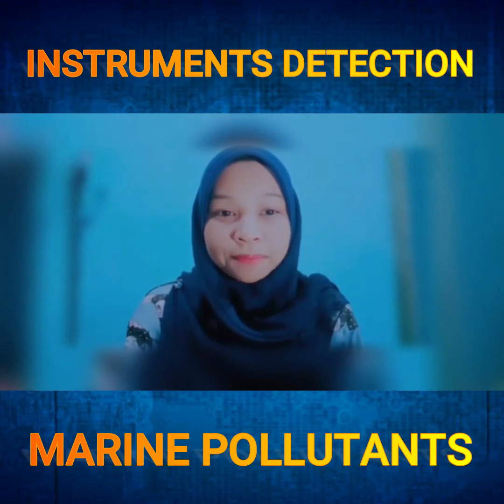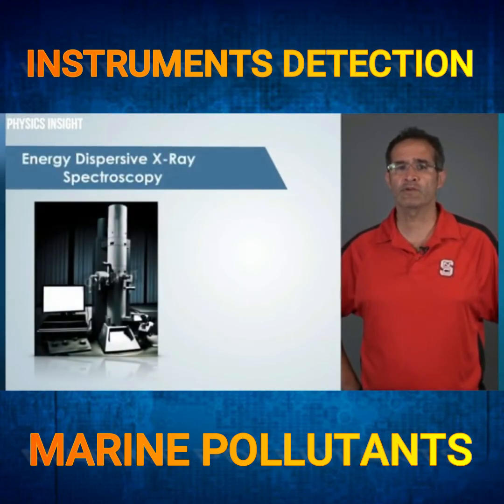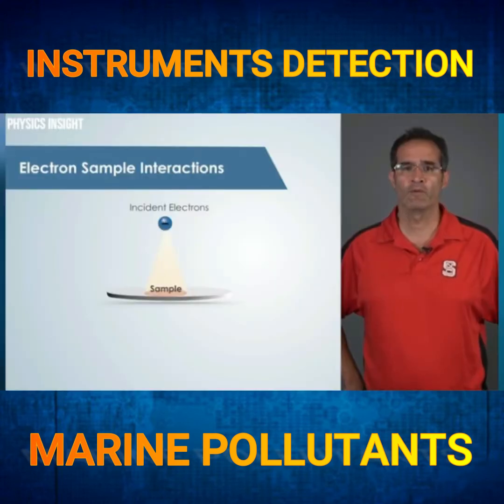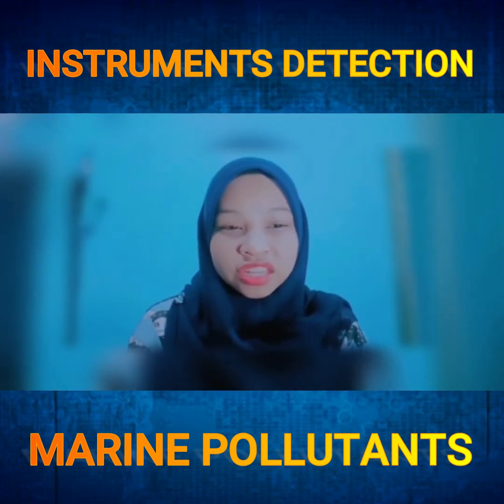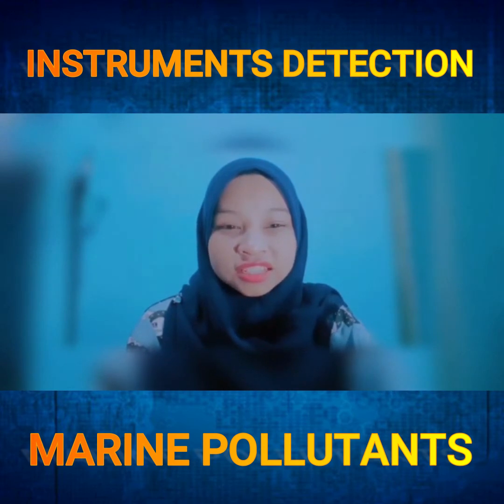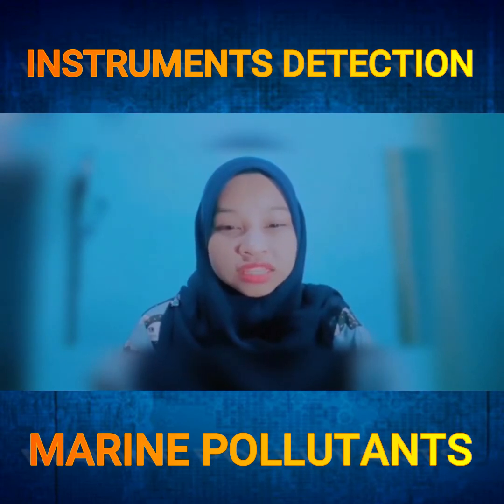A filter positioned between the sample and the detector is used to improve signal, reduce background, and focus on certain regions of the spectra. Next, for the fundamental principle, an alternative process is indirect excitation, in which the observed fluorescence is produced as a secondary process by photons. X-ray is an electromagnetic radiation generated by high-energy particles and atoms. This radiation has wave-particle duality. X-ray fluorescence, XRF, uses primary X-ray photons to excite the atom to produce secondary XRF for material composition analysis.